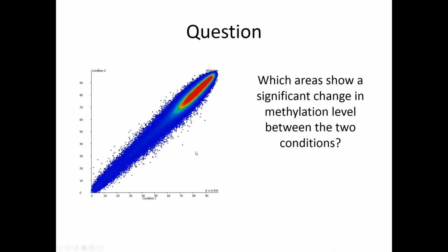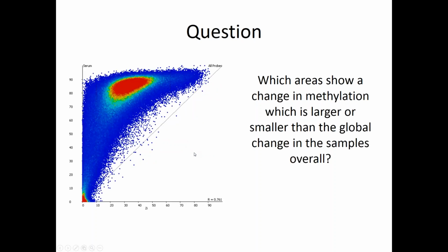Sometimes that question doesn't make sense. This is the same plot that I showed before. We could ask what changes between these two samples, but looking at the global difference between them, we can see that pretty much everything changes between these samples. So that doesn't end up being a sensible question to ask.